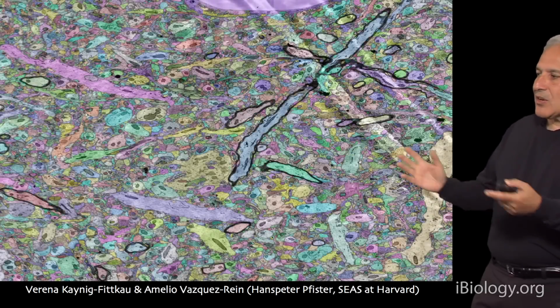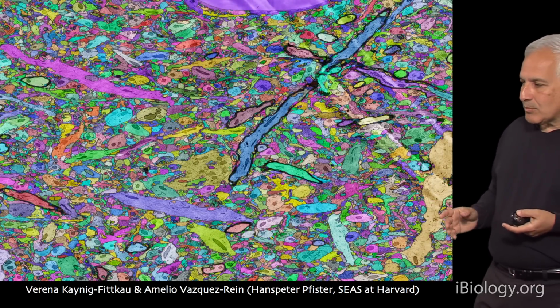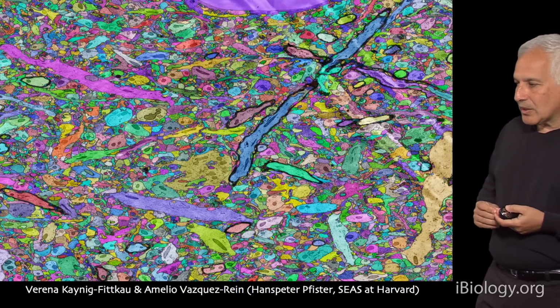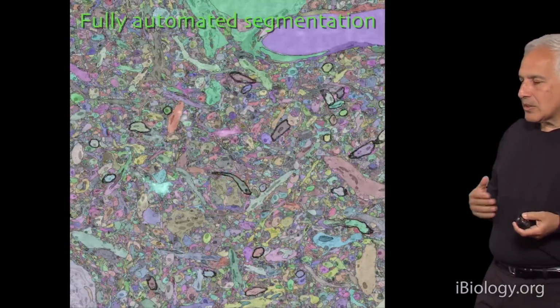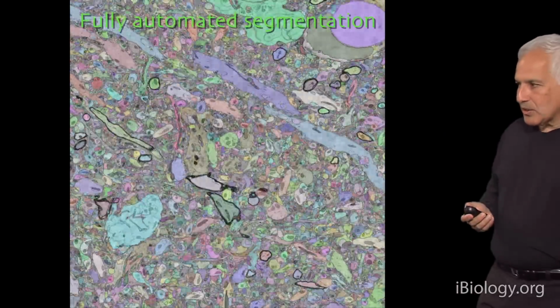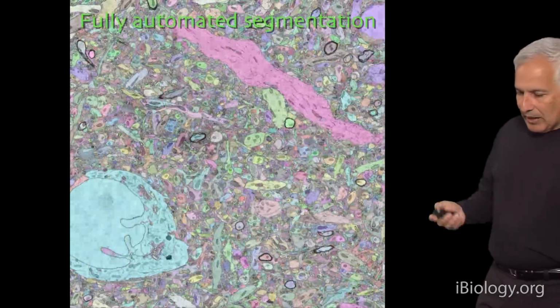What you'd like is to have everything colored in, and here is everything colored in, but not colored in by a human being, but colored in by a machine, by computers. This is work that we're doing in collaboration with an engineering lab at Harvard, Hanspeter Pfister's lab. And that kind of data generates wiring diagrams much, much faster than humans can generate them. So this is entirely automated, and the algorithm is getting better and better and better.